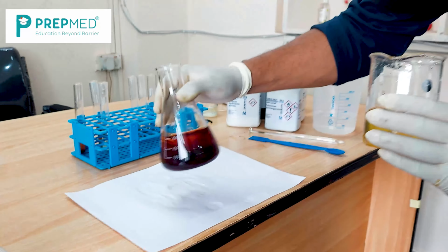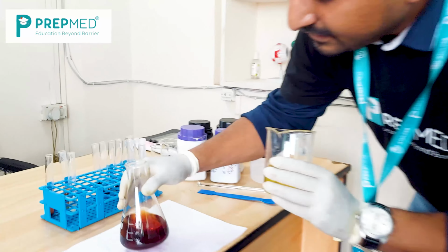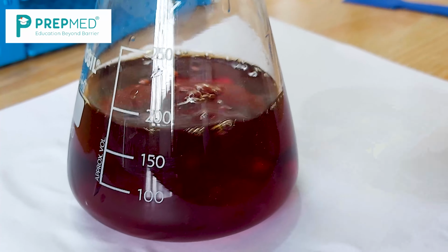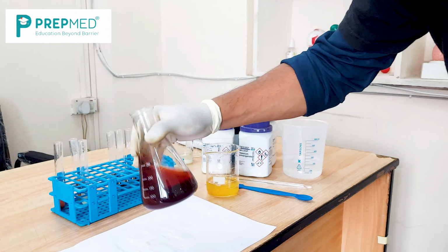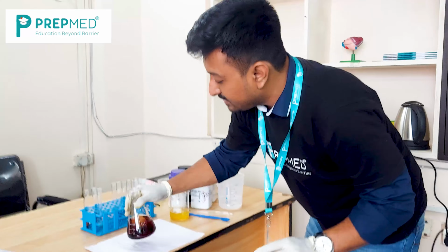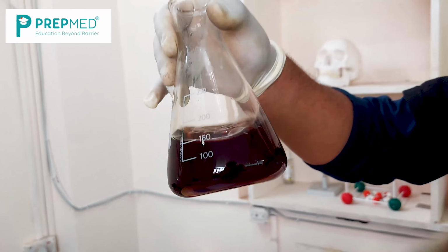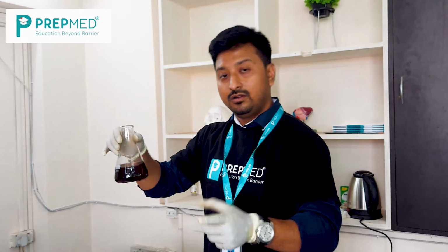This is manganese in +4 oxidation state, and you can see that if you add even more of the alkaline glucose solution, the solution will remain in +4 oxidation state. So what does it suggest? It suggests that in alkaline medium, the KMnO4 changes color from violet to green to red. That is, the oxidation state changes from +7 to +6 to +4.